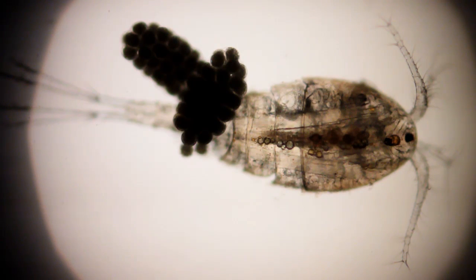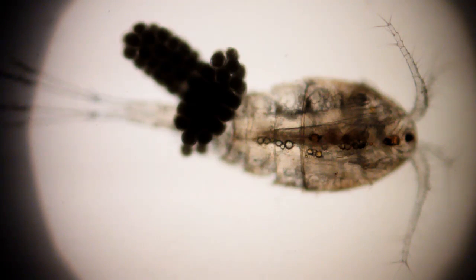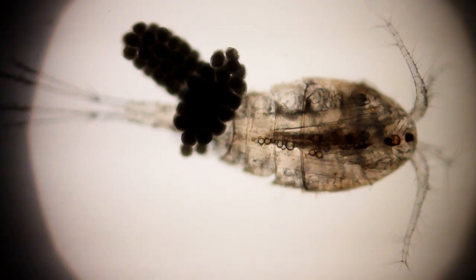You can see food vacuoles inside of her. I guess that's her gut there. They have no heart or lungs or gills. She's just barely big enough to see with the naked eye if you watch close.